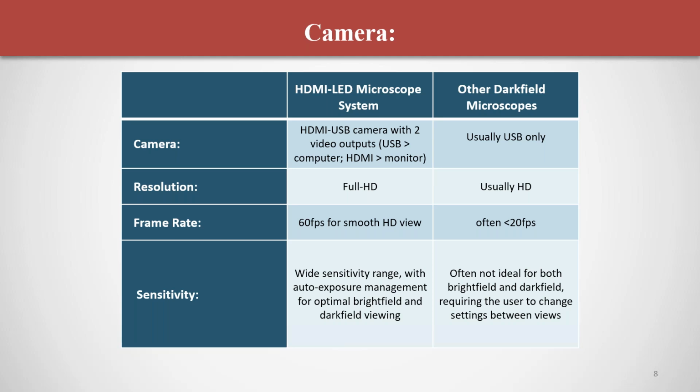And then also important is for the camera to automatically adjust between bright field and dark field. So the HDMI camera has a fairly good system built into the camera that automatically adjusts the exposure from bright field to dark field, so that you, as the analyst, don't really have to adjust anything on your software when working with a microscope from going from one setting to the next.